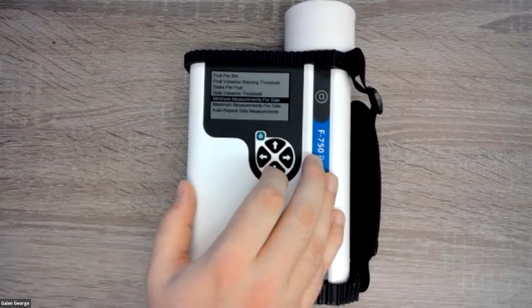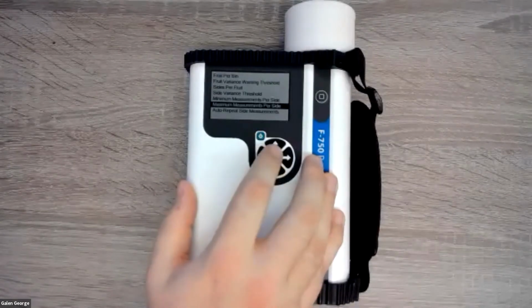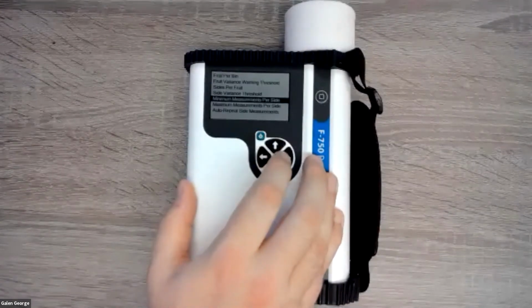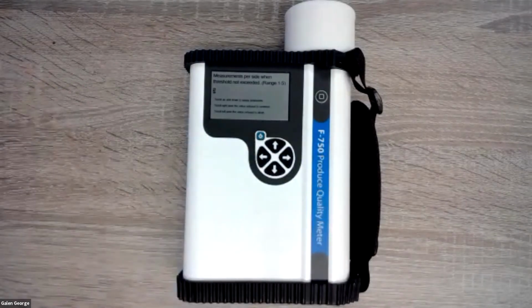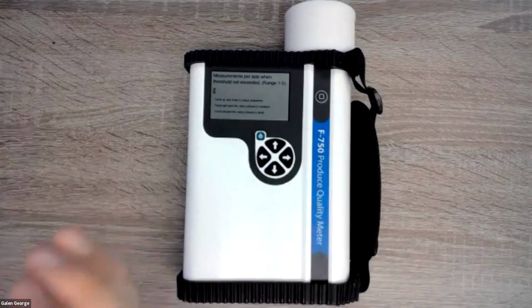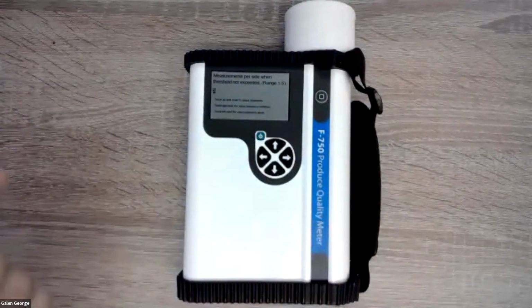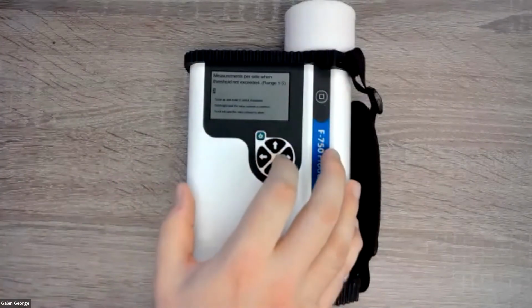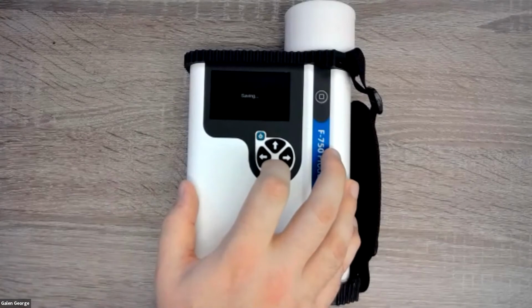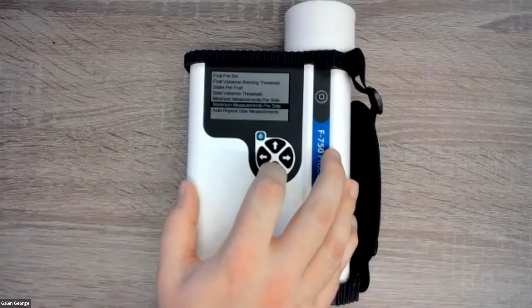We can also change the minimum number of measurements per side, as well as the maximum measurements per side. So this is where I have it set to the value of 3. So you saw that it did those 3 scans. So I have the minimum measurement set to 3. You might have it set default to 1, so you only take 1 scan per side. But as I mentioned, doing 3 scans is a more accurate way for us to assess the avocado dry matter.